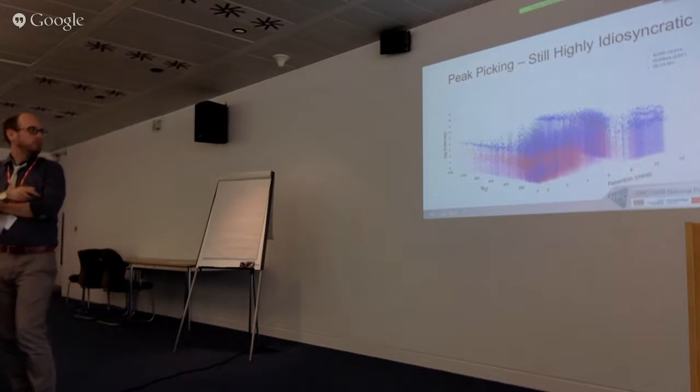So just as a way of presenting this, I've used 3 common peak picking tools here to peak pick one single data set. And so we have intensity, retention, and mass. So in blue we have XCMS, I imagine a lot of you use this. Green we have the grid mass algorithm out of MZmine, and then in red we have Progenesis QI, which is the peak picking software we use in-house. And you can see we've got all sorts of differences here.